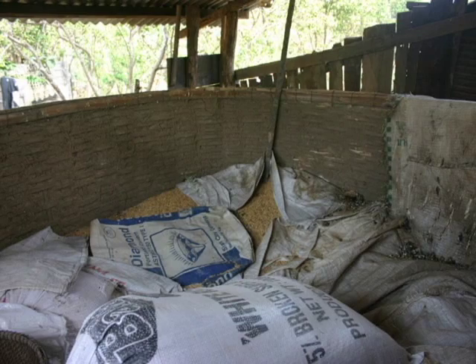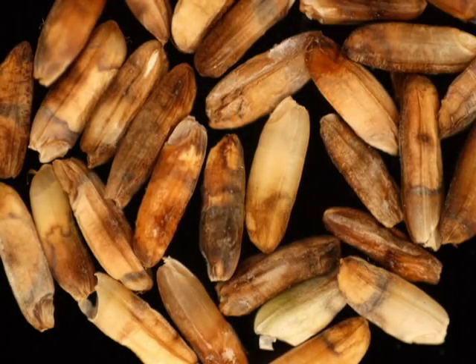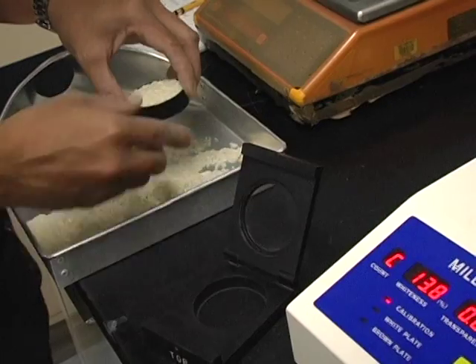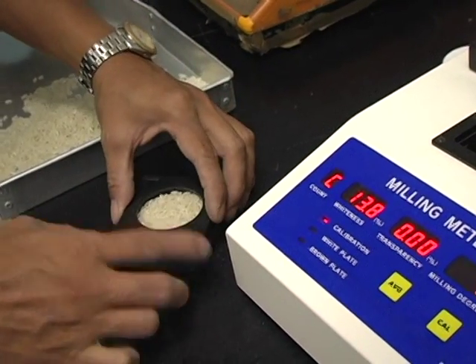Improper post-harvest operations usually lead to discoloration of grains. The whiteness of rice is therefore often an important indicator for good quality milled rice. To measure the whiteness of the rice, measure the grain whiteness using the whiteness meter.